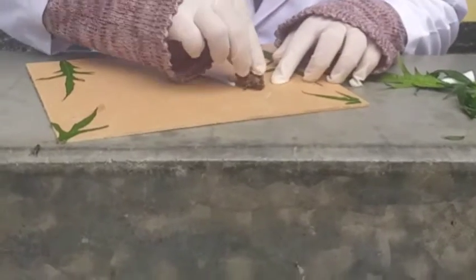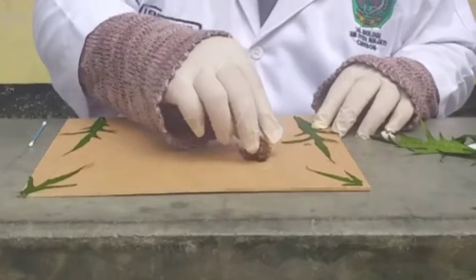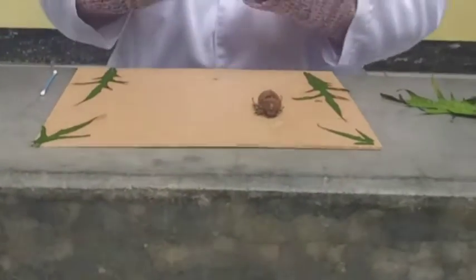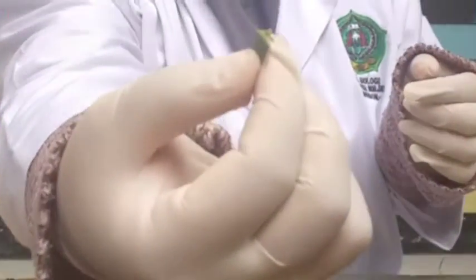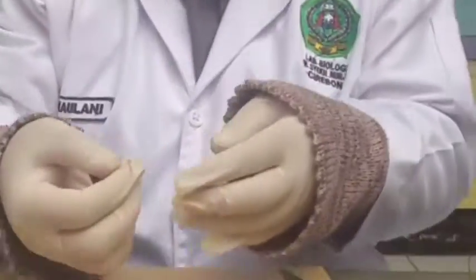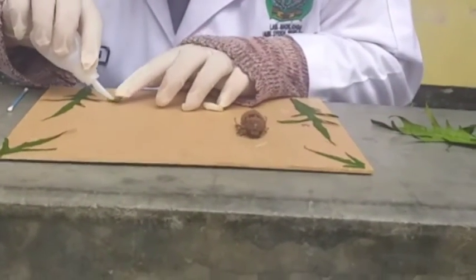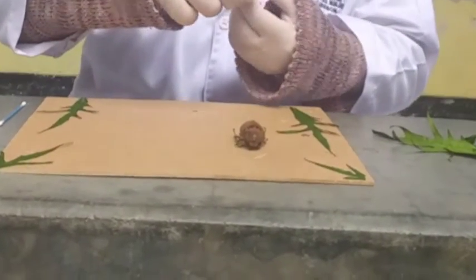Di sini saya merentangkan kaki-kaki spesimen menggunakan cotton bud. Selanjutnya, atur posisi dari spesimen. Lakukan hal yang sama terhadap spesimen-spesimen yang lain. Lakukan dengan sangat penuh hati-hati dan teliti.